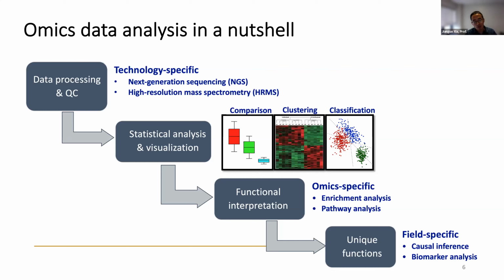which is also related to what type of data you're getting. Sequencing and mass spec require very different expertise or packages for pre-processing. And quality control is also critical, and you need to have some experience to see what's good quality or what's garbage. So this part is more or less standardized, but it really requires a lot of initial input to understand and to feel comfortable.